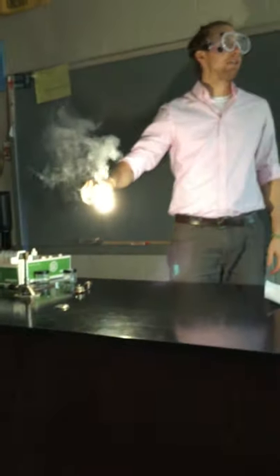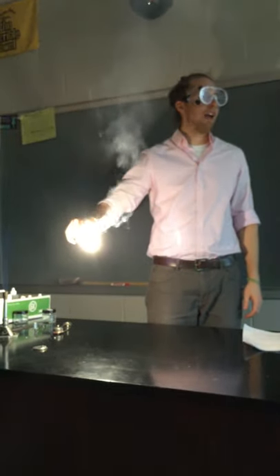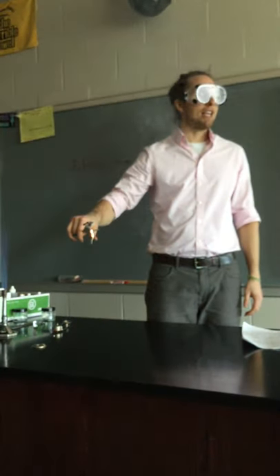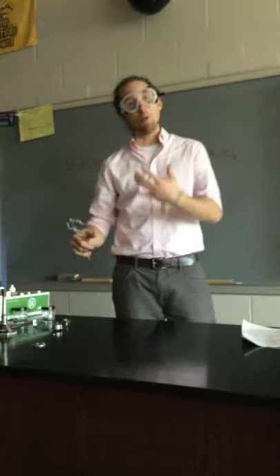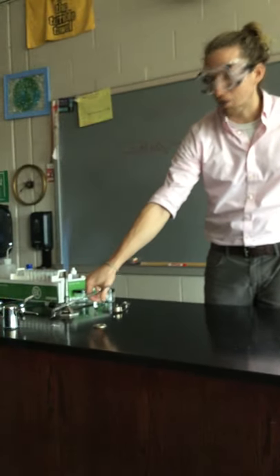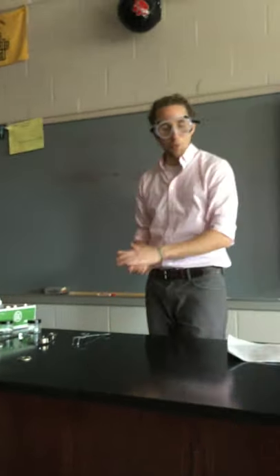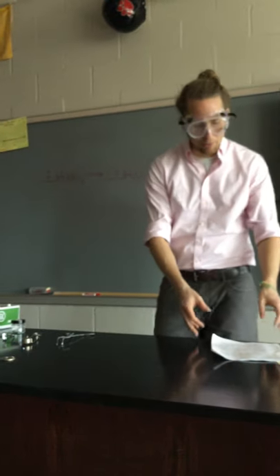All right, there's my magnesium. Again, we're not looking directly at it. You can see that certainly something is happening. There's a lot of gas being given off. You can predict what gas that was using the reactions that you've already written out. So that was reaction 1, pretty straightforward but also a pretty cool reaction.